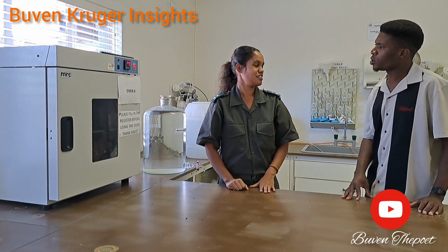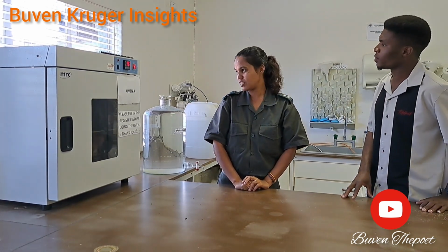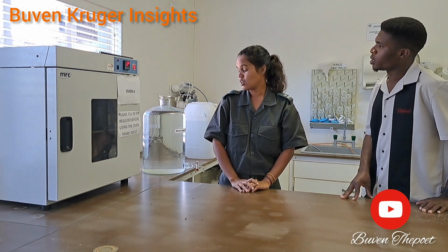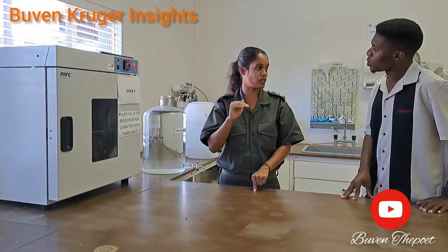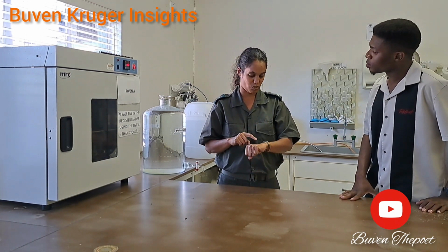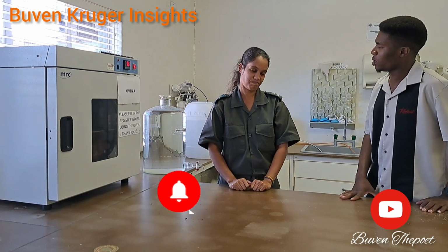Okay, so you said you keep it in here for 24 hours. Is there somebody who keeps watch, or are you very sure that nothing will go wrong? Very sure. This is a good oven and I'm sure it'll stay at 105 degrees because we set it at that temperature. Even if there's load shedding and the power goes off, it remembers that it was set at 105, so it will go back to that and continue. It will only go off when I come back. I know which date and time I put it in, and I'll make sure I come back tomorrow at the same time to switch it off and measure it again.